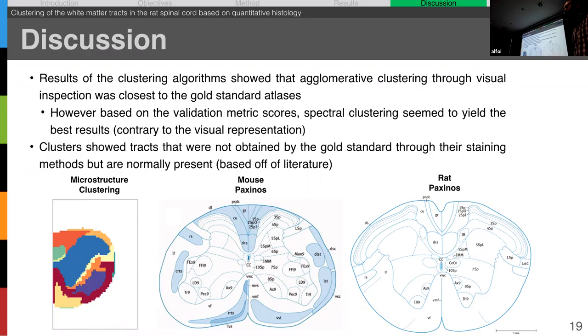A couple of small points. AxonSeg's key algorithm is based on discriminant analysis. And it does, in fact, look at morphological features, because the discriminant analysis uses priors such as axon diameter range. One thing you did not mention, but it's amazing news, is that the follow-up project that you're doing is based on a project that has recently been accepted for minor revision in eLife a week ago, so it should be mentioned.